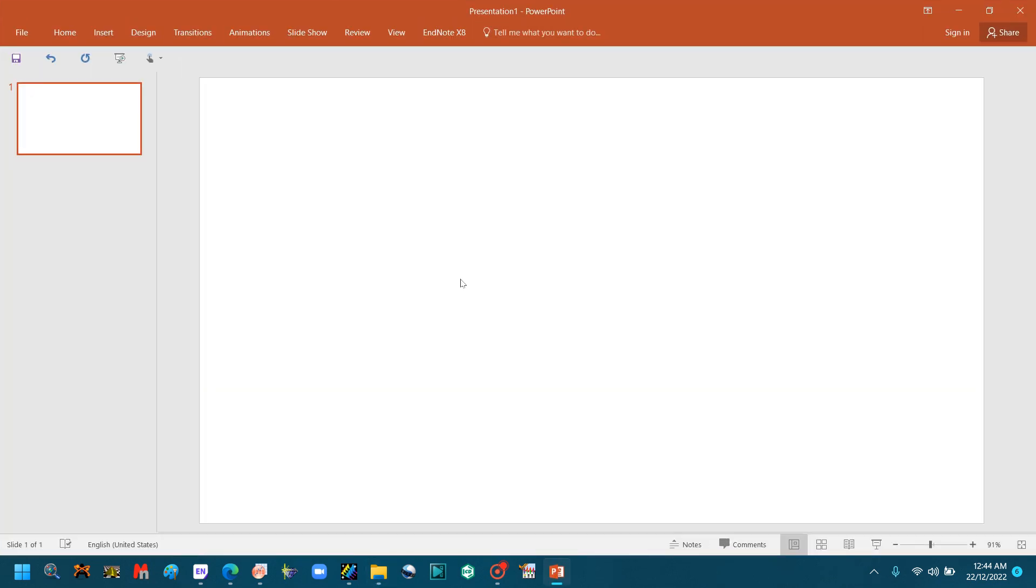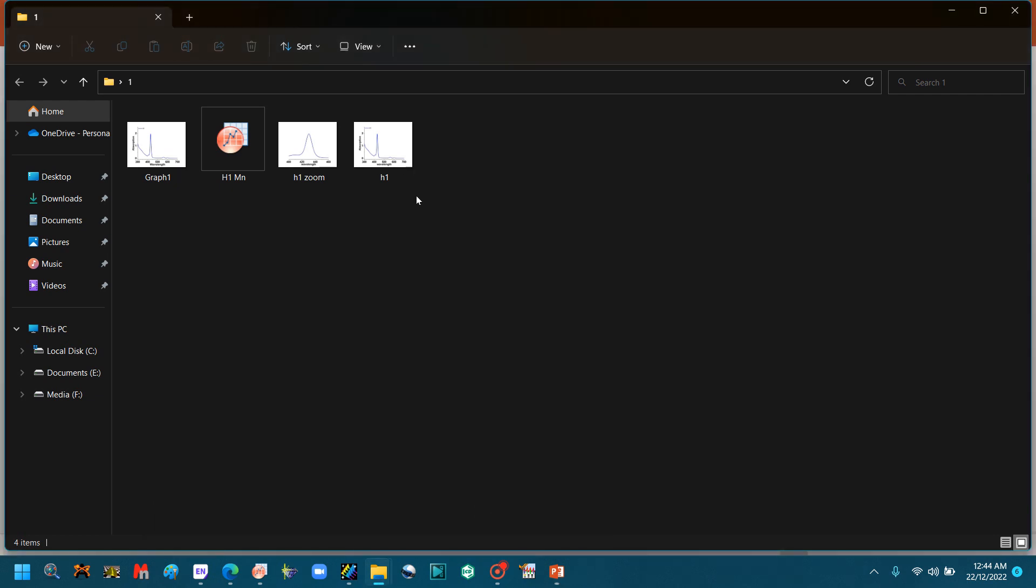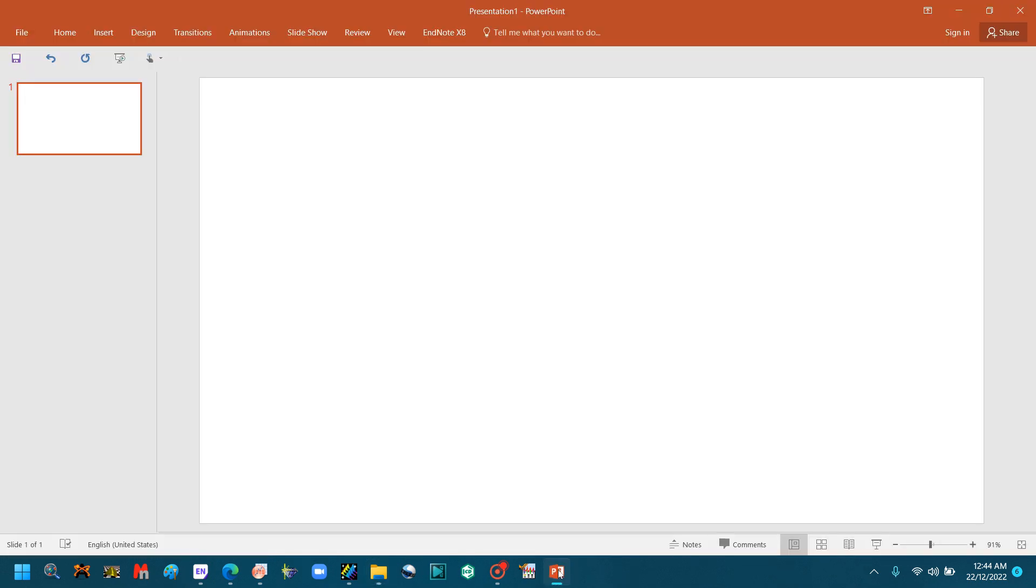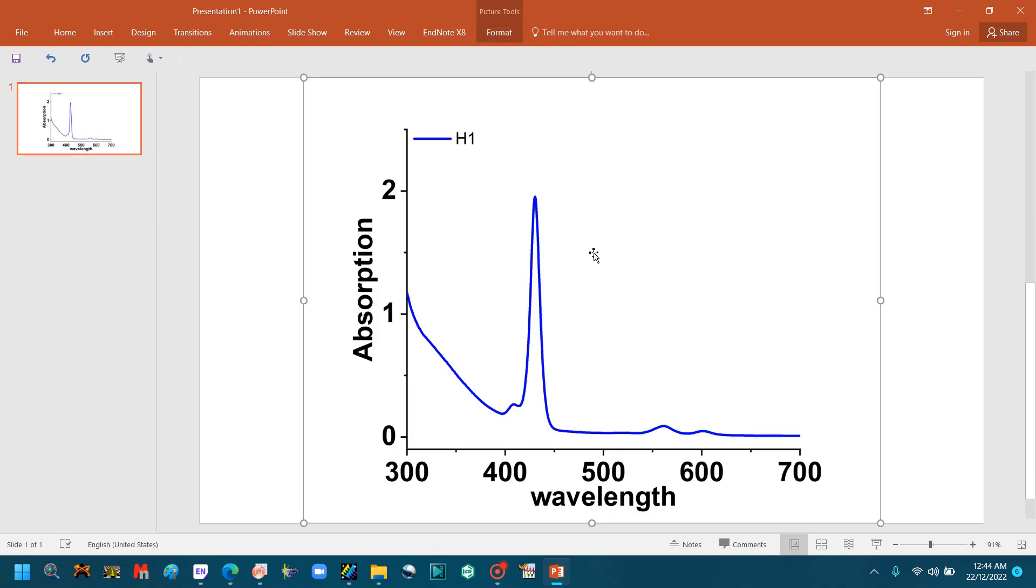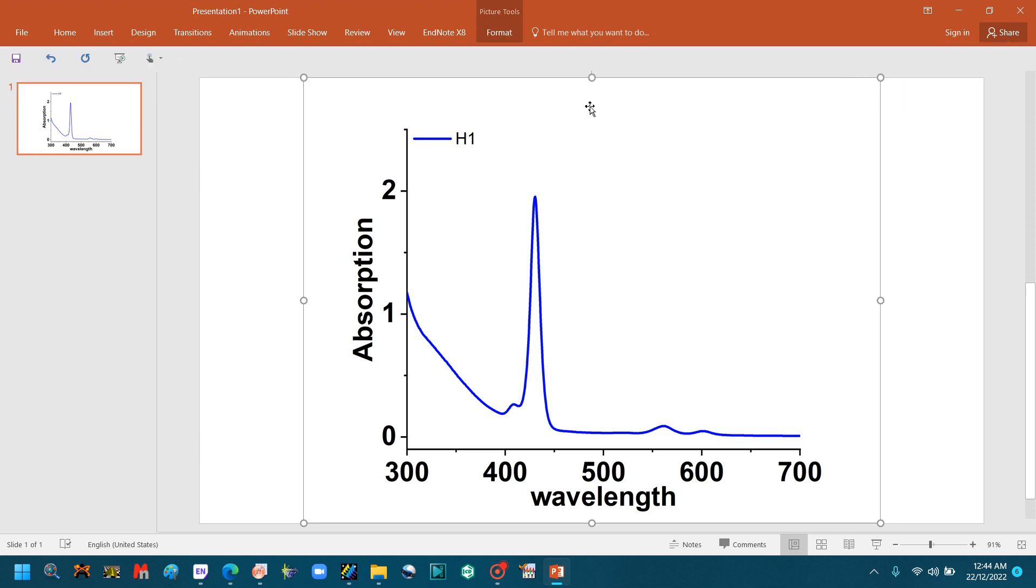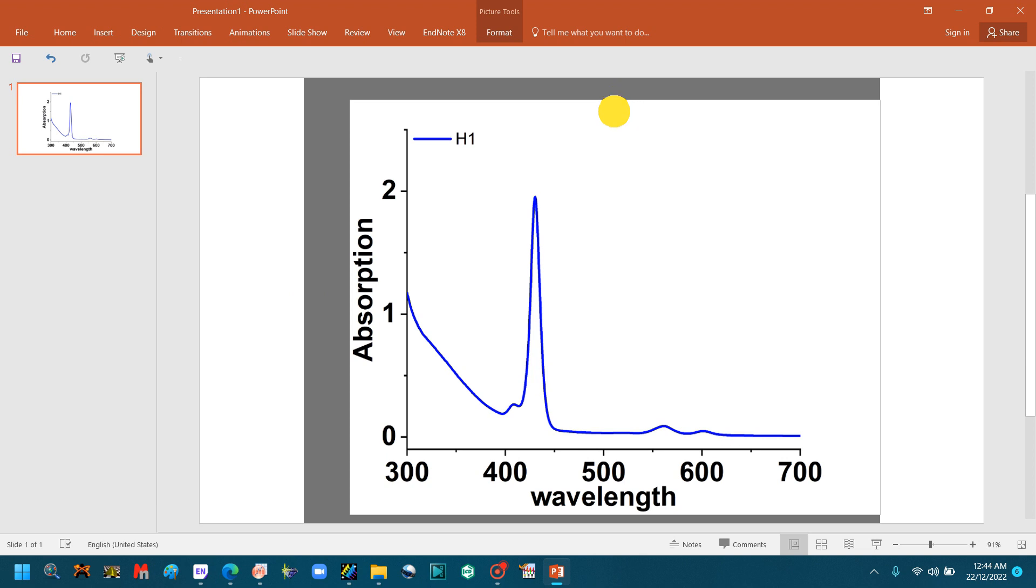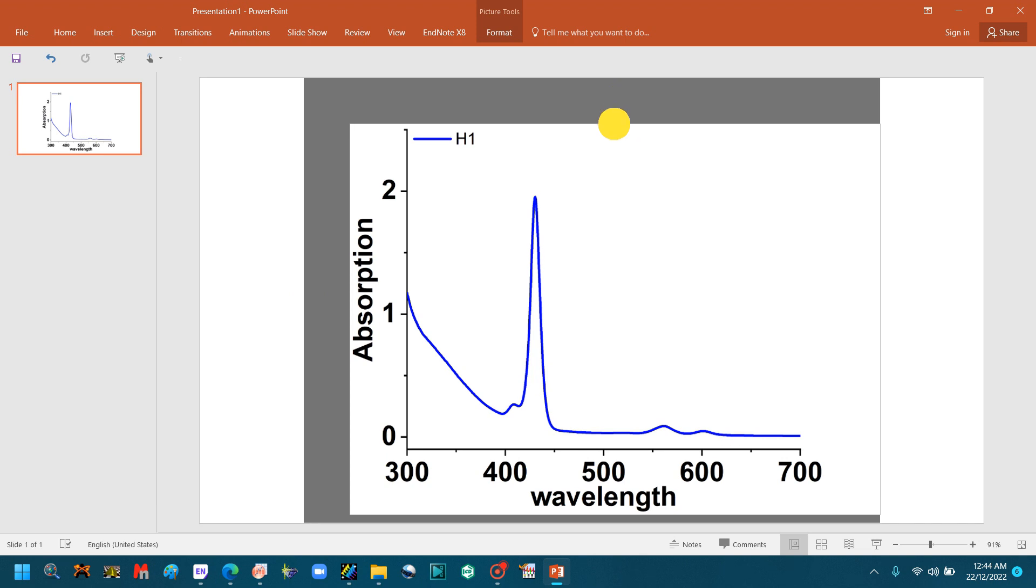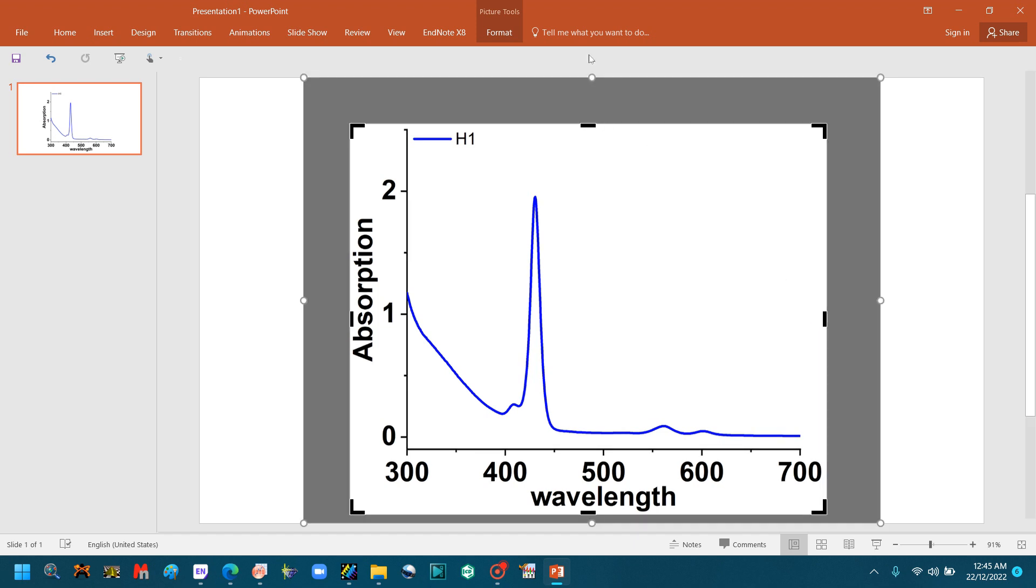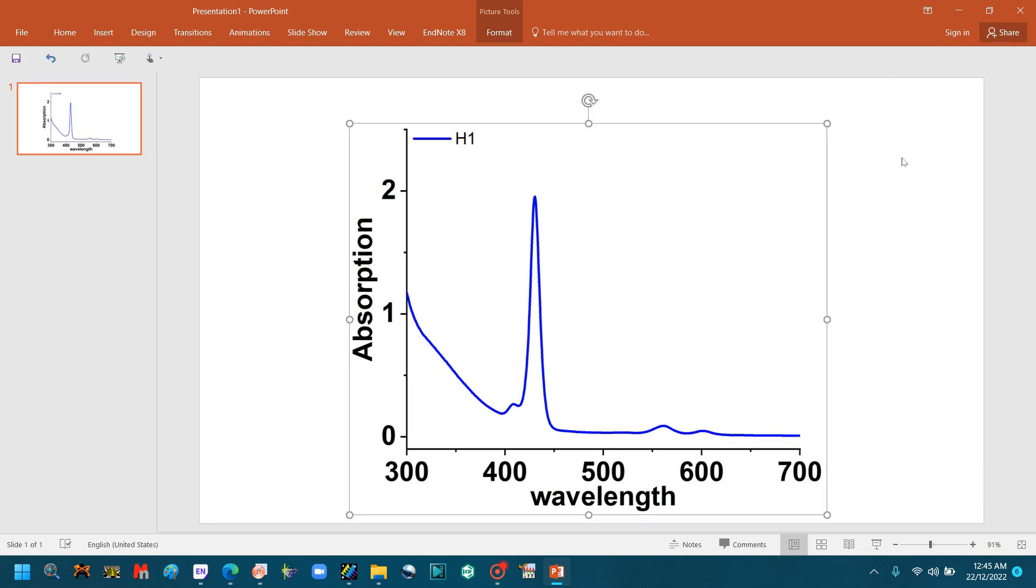Select the TIFF files, Ctrl+C to copy, and then paste here with Ctrl+V. Arrange the position of this file. First, here we should remove the excess area. Go to Format, crop it. Presentation is very important for the article, so your images should be very accurate and look cool, because they will prove your data is correct or not.